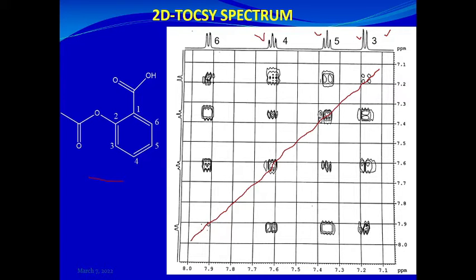You start from a diagonal peak, go to the right, meet a cross peak, go up, left, and down — you have a square. This means the proton resonating at about 7.18 is correlated with the proton resonating at about 7.36. You can also read these values from the vertical scale: one is resonating at about 7.17 and the other at about 7.35 or 7.36.